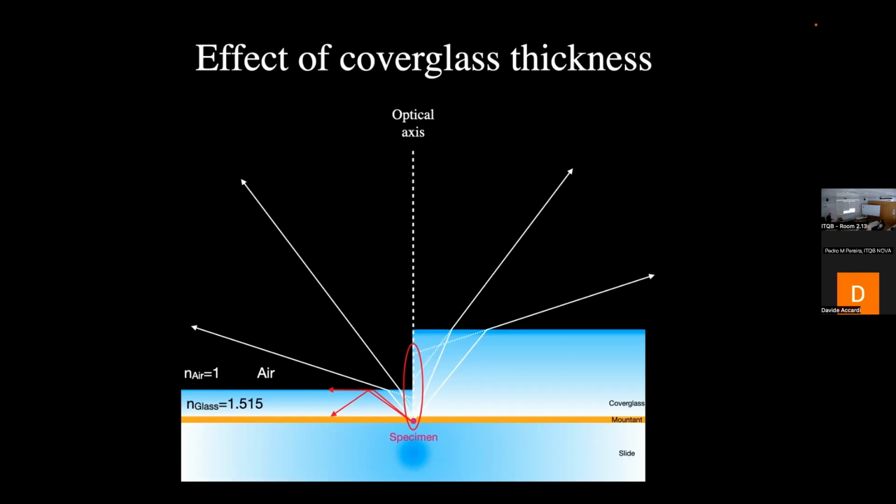And then, what if we have oil, as your colleague asked, that is actually with a higher refractive index than glass? So then the rays of light will be converging instead of diverging from the optical axis, because they will slow down. Okay, you will collect more rays of light, but the problem is that then your structure, instead of appearing so elongated, will appear squeezed.